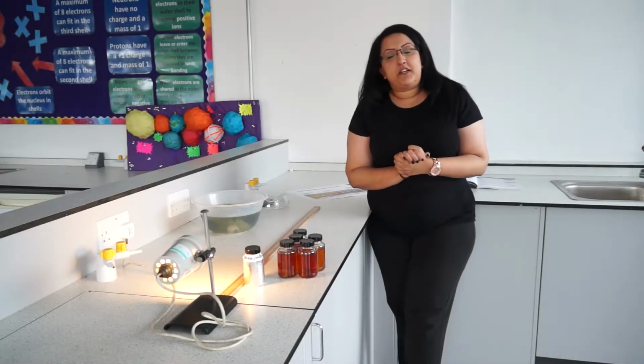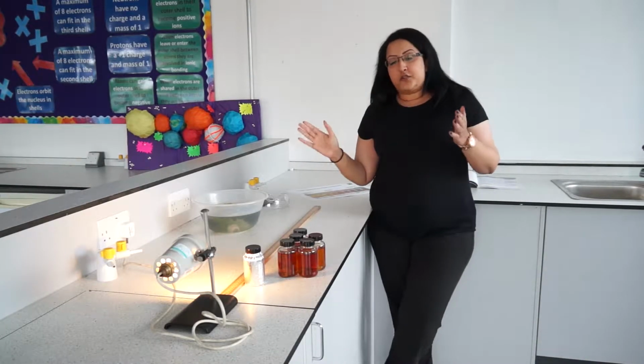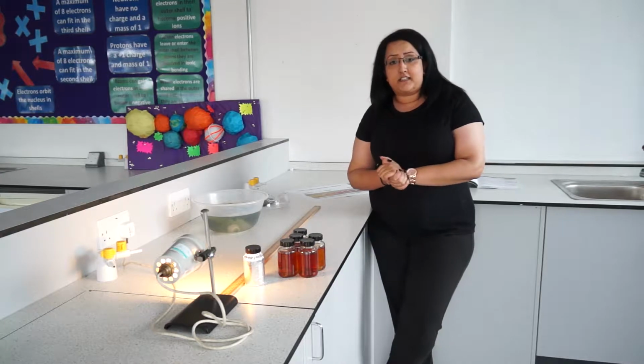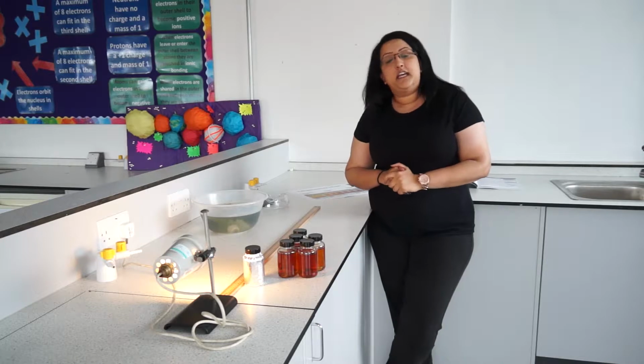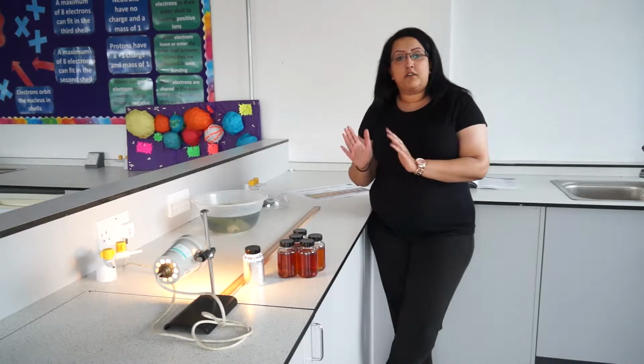So in topic 6 you have been learning about photosynthesis, and in this practical you will be investigating factors that affect the rate of photosynthesis.